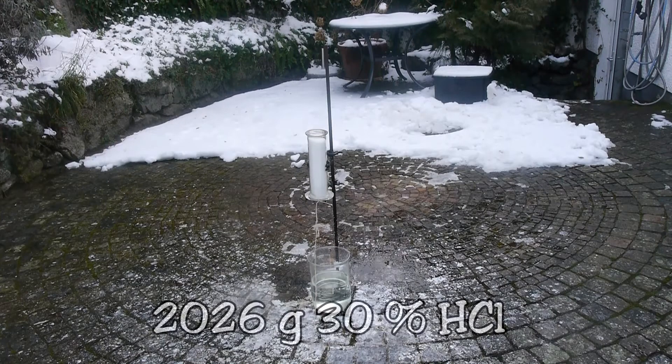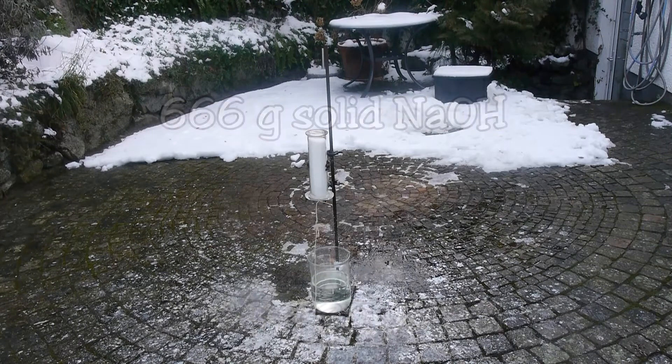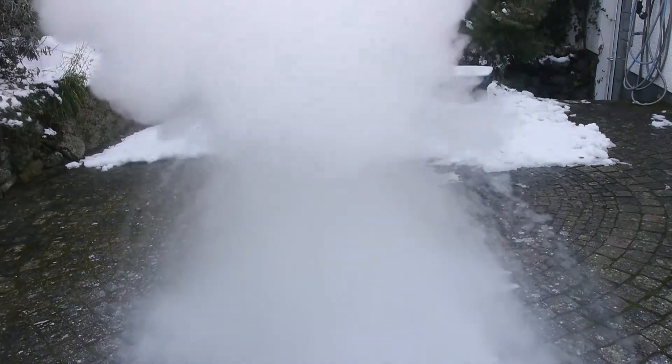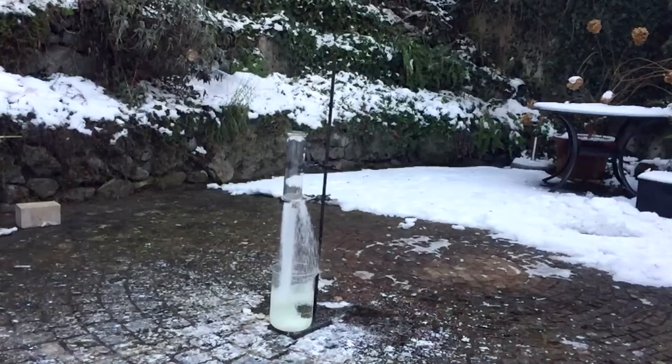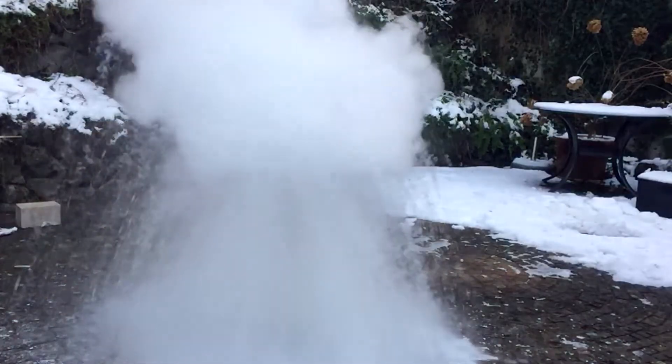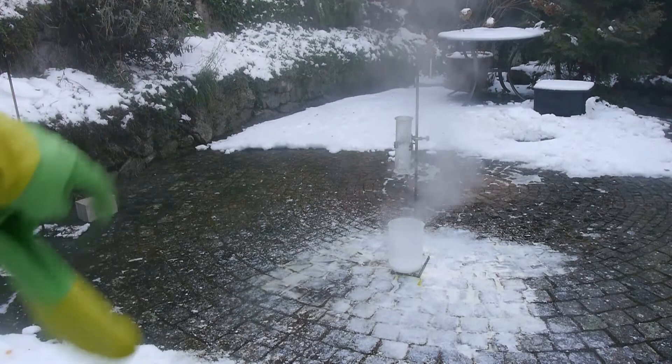Next on the list is 2 kilos of 30% fuming hydrochloric acid with 666 grams of sodium hydroxide. The water helped catalyze the reaction a lot — that was epic. This has created a whole bunch of table salt down here, but I would not want to eat that.